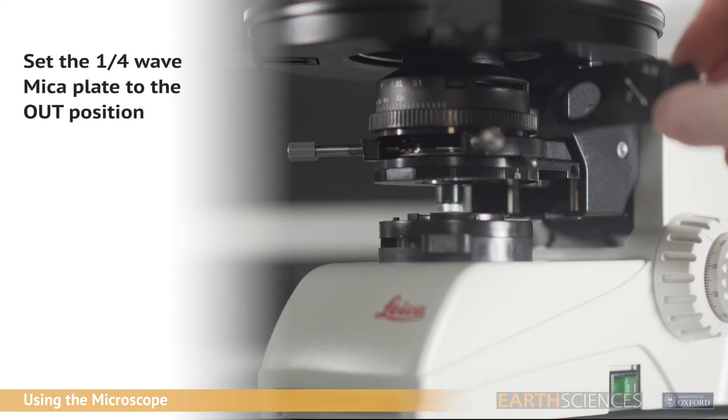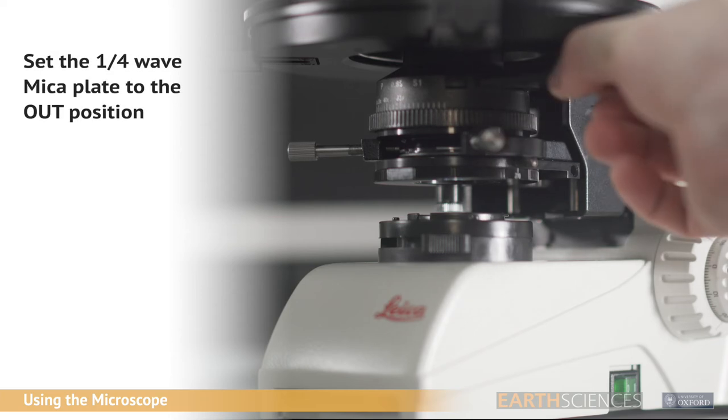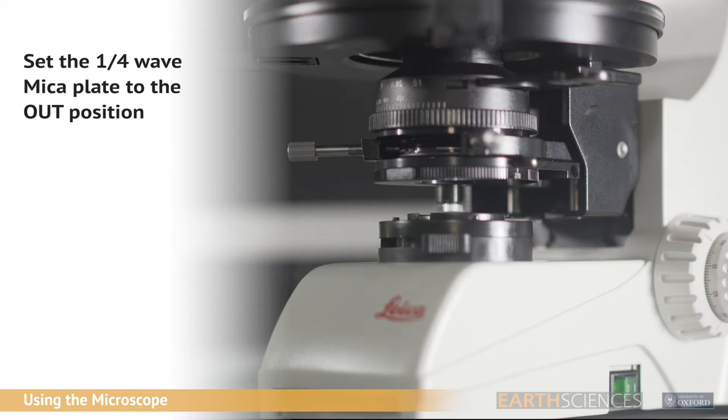Also on the right hand side, directly under the stage, is a slot which accepts the quarter wave mica plate. Ensure that this is in the out position.